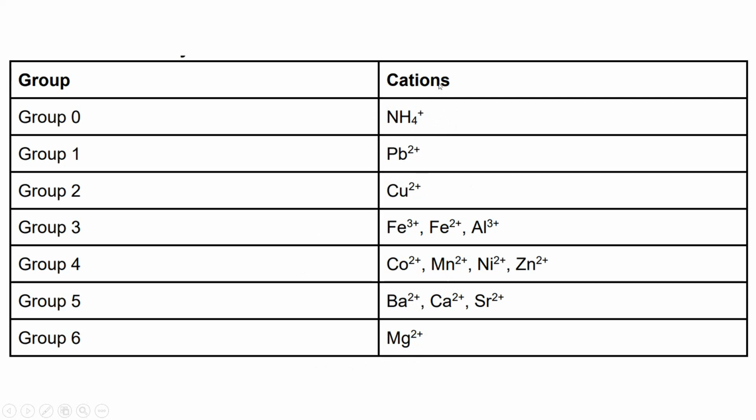Right. Now coming to the point here. So first group is lead and second group is copper. Second group is copper in the sense it's a colored salt. There is no possibility of getting copper, but there is a slight possibility to get copper in group 2. And group 3, you can clearly understand that the ferrous and ferric are colored salts. Right, the ferrous and ferric are almost colored salts. We can identify by the color itself.